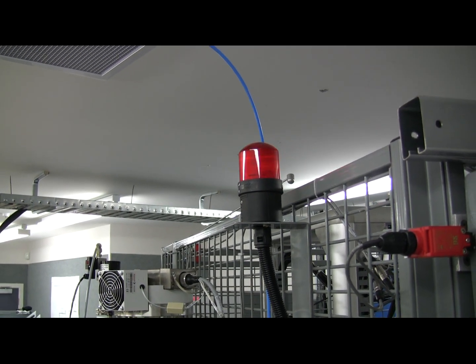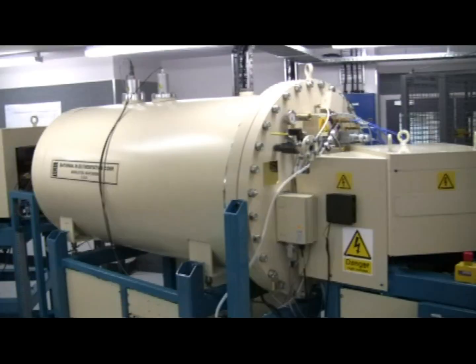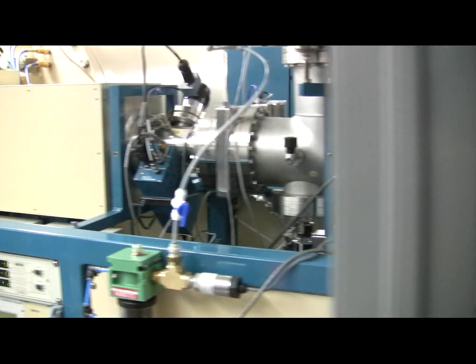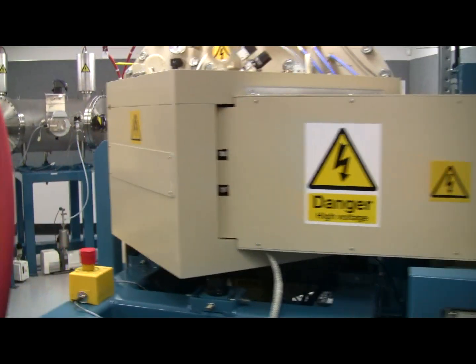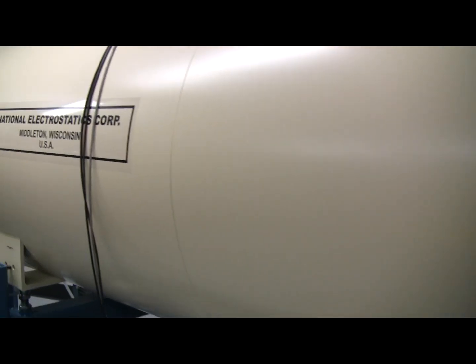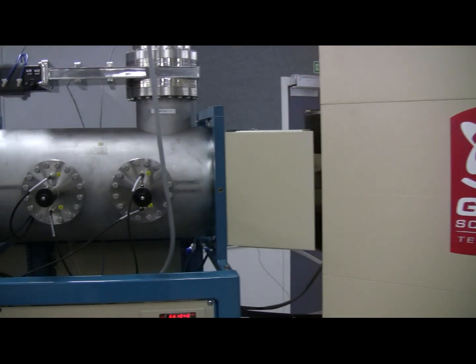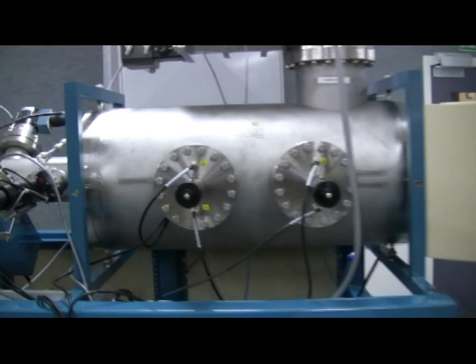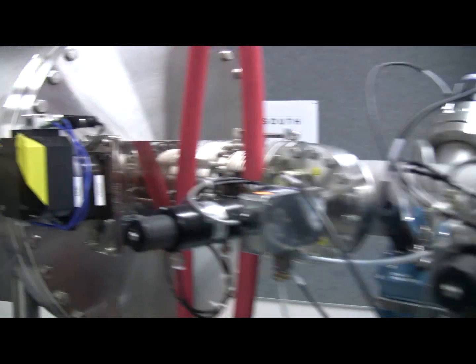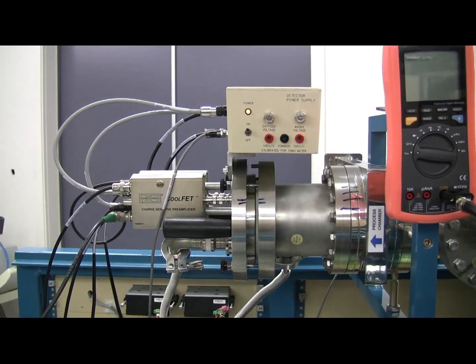The source is a cesium beam that blasts the carbon out of its target holder and into the accelerator. The stream of carbon ions goes through the accelerator, being bent at certain places by magnets, which serve to separate out the carbon 12, 13, and 14 into separate streams. The carbon 12 and 13 are separated out at this point, and the carbon 14 continues on through the accelerator to this point where it is detected.